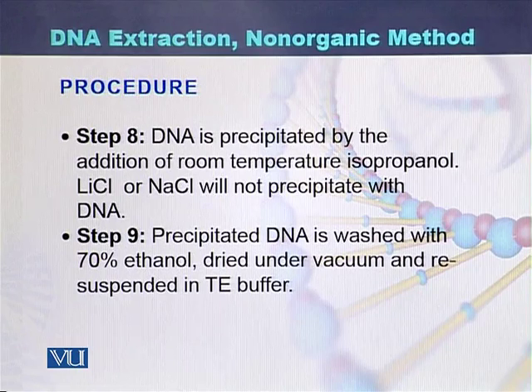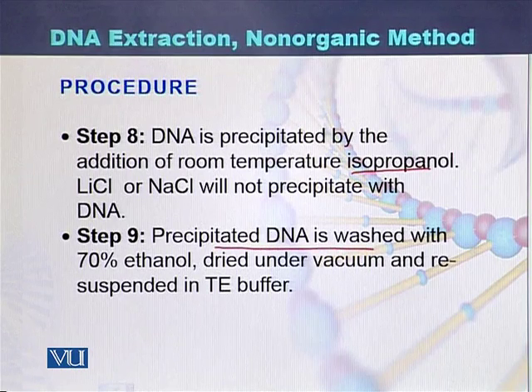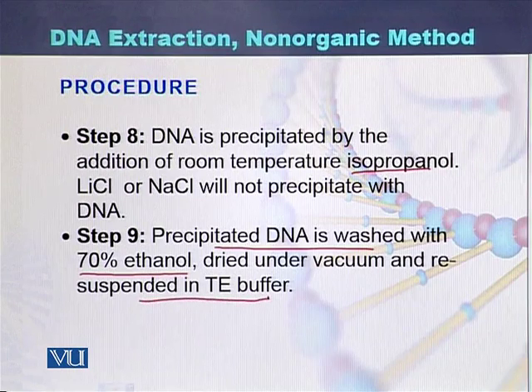During the next step, DNA is precipitated by adding isopropanol or ethanol. So it can be precipitated either by adding isopropanol or by adding ethanol. During the ninth step, the precipitated DNA is washed with 70% ethanol, dried under vacuum or at room temperature, and it is suspended in the TE buffer.